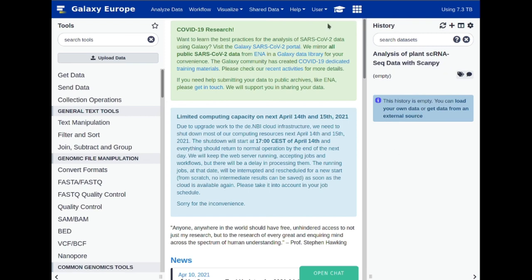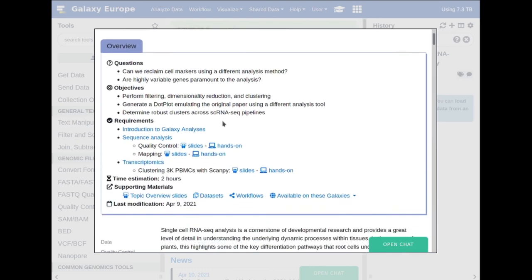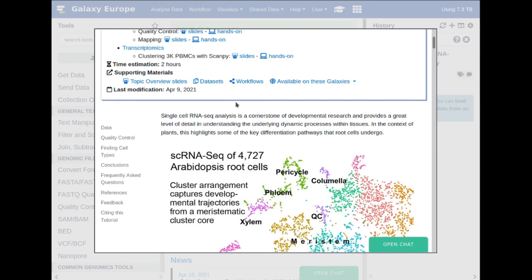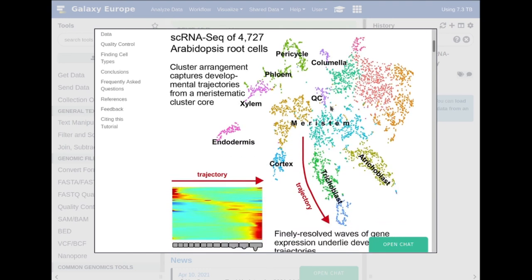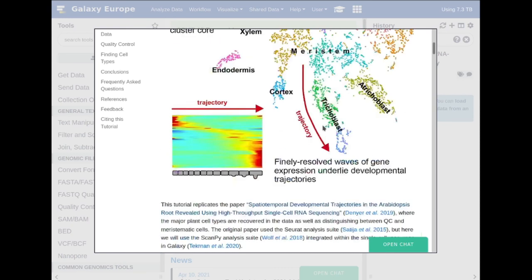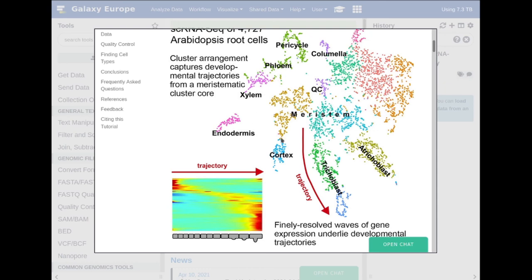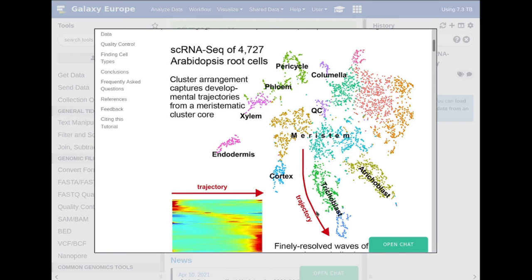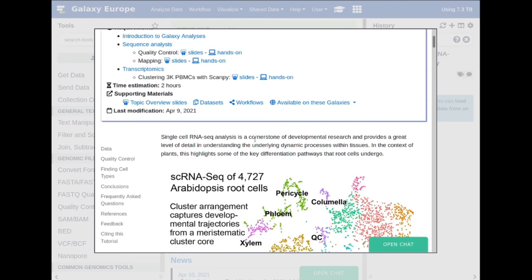Let's go back to the tutorial by clicking on the hat. In this tutorial, what we will be learning is very similar to the same tools we learned in the 'Clustering 3k PBMCs with scampi' tutorial — if you are not yet familiar with that, I recommend you do that tutorial first. We will be using the same tools, but this time looking at a plant dataset from a 2019 paper, which identified a differentiation pathway where meristemic cells differentiate into trichoblasts and other cell types. We wish to recapitulate this clustering using Galaxy via the scampi tool suite.